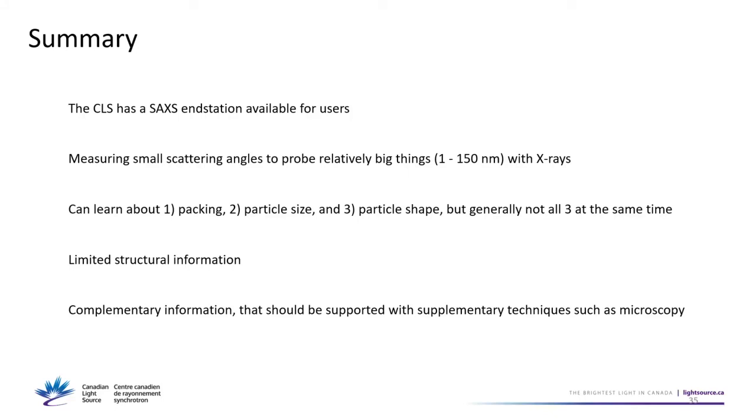And it's limited in structural information. That's often complementary to other techniques. So it really thrives in combination with microscopy like cryo-TEM or X-ray microscopy.